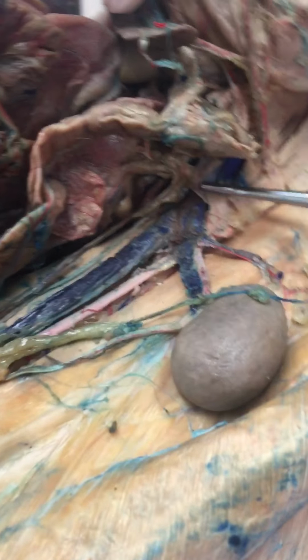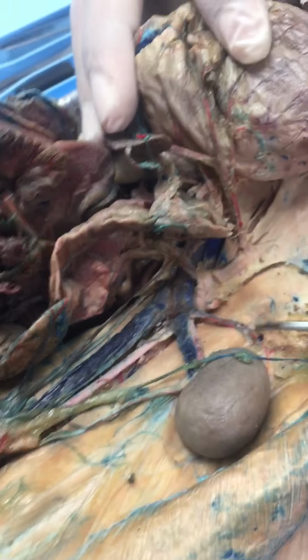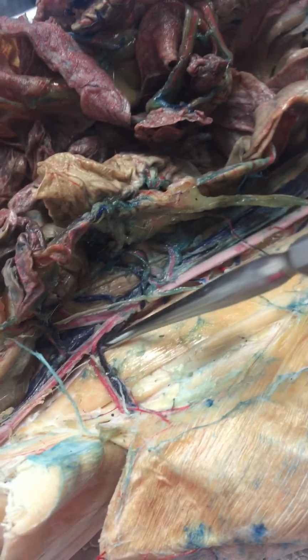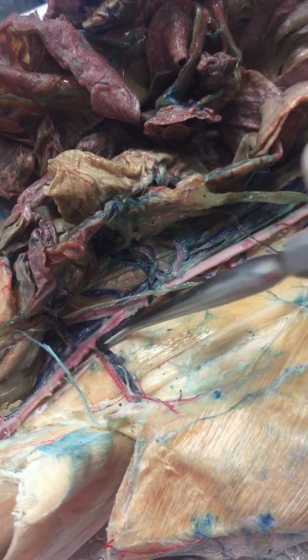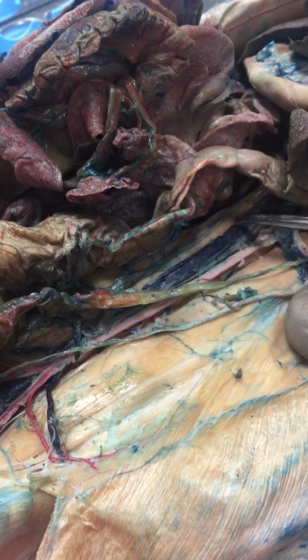Then we have our superior mesenteric, inferior mesenteric, our adrenal lumbar with our adrenal gland here. Our renal goes to the kidneys. This one's going to be our iliolumbar vein and artery. This one's our abdominal aorta and our descending vena cava. I think that's it for here.